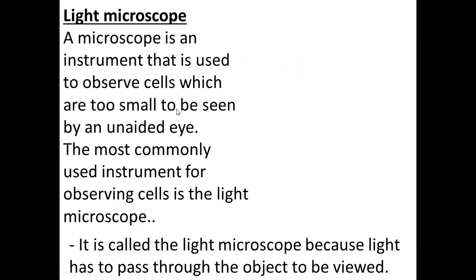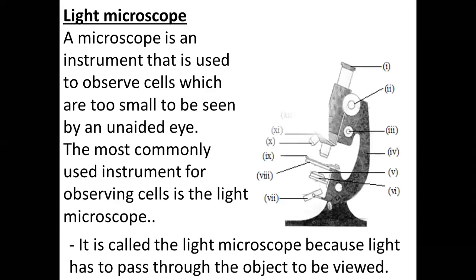Some of the aspects that we are handling here may also help us even in theory work, but mainly we concentrate on the practical aspect. But you realize that you cannot thrive in a practical unless you have the backdrop. That is the theory. So I will not take much time dealing with the parts of a microscope, but we may, in a very quick way, go through the microscope, and especially the light microscope.